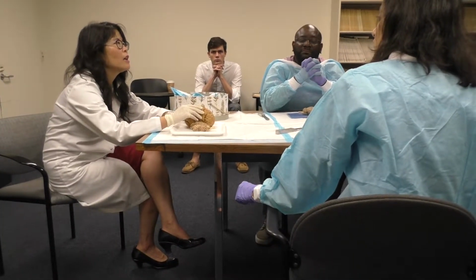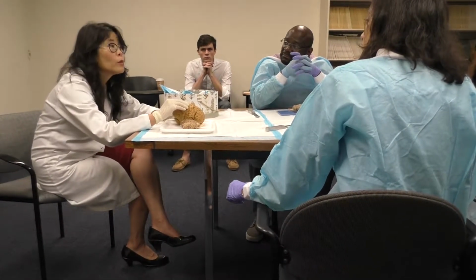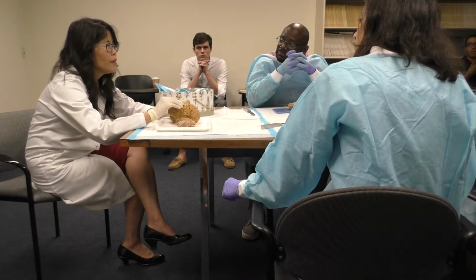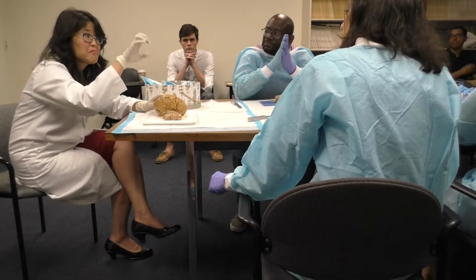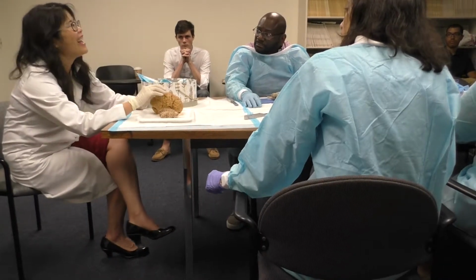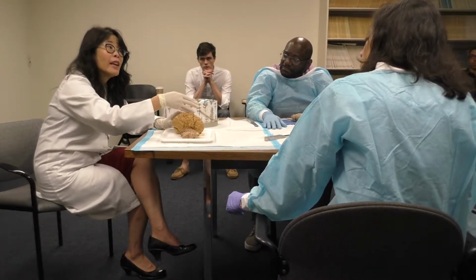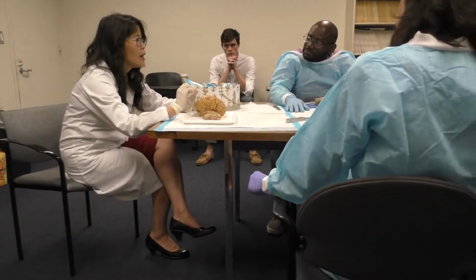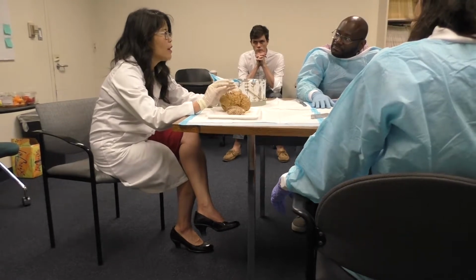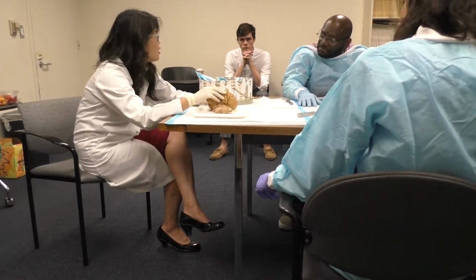I don't think when you go down into worms or insects, insects have symmetry too, right? There's the right claw and the left claw. But they don't have nearly as clearly demarcated symmetry in the brain. They tend to be organized with neural nets rather than this very complicated structure.